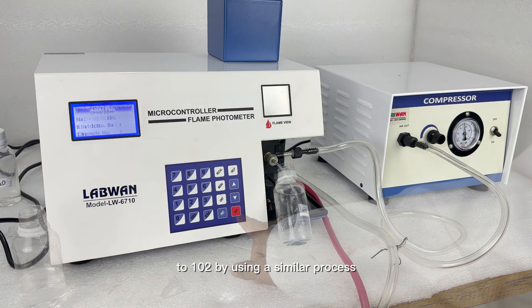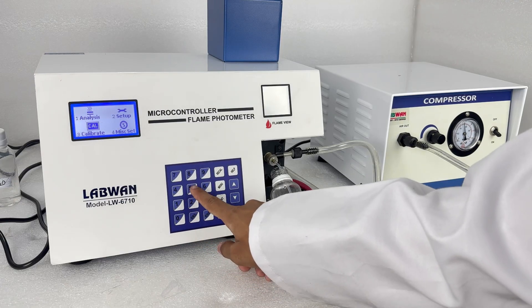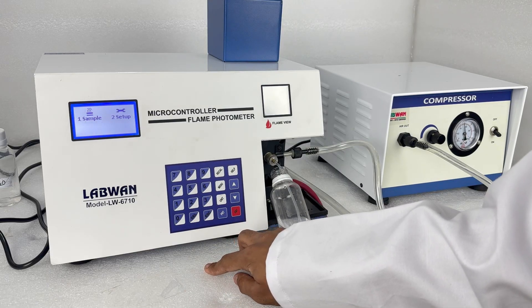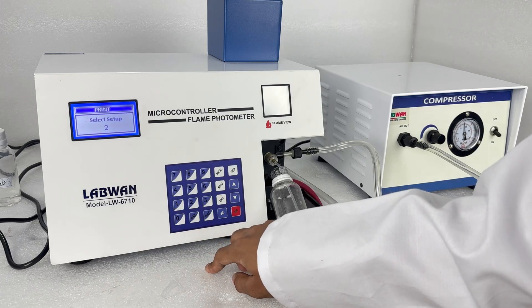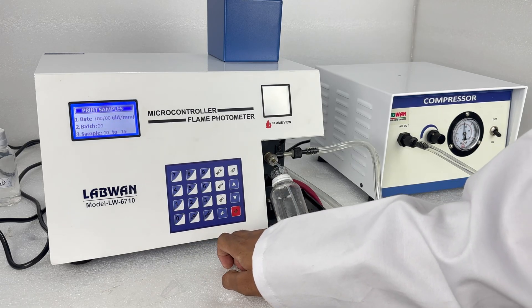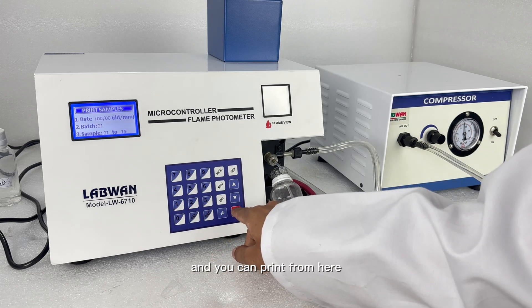By using a similar process you can save your setup, calibration, and analysis of your sample solutions. For printing, select 4 and go to print. Then go to sample and select setup, batch number, and sample number, and you can print from here.